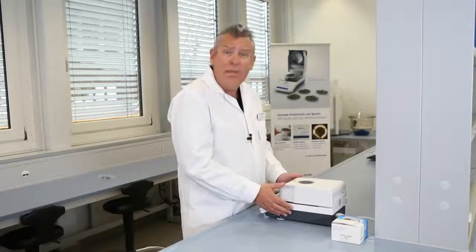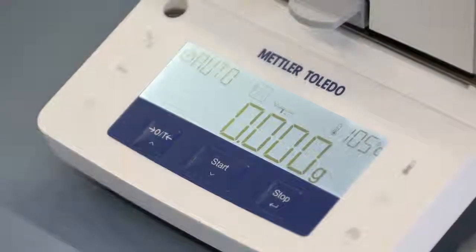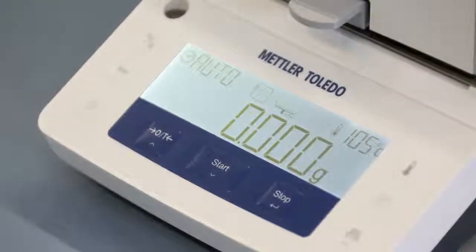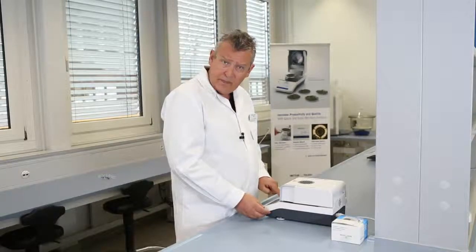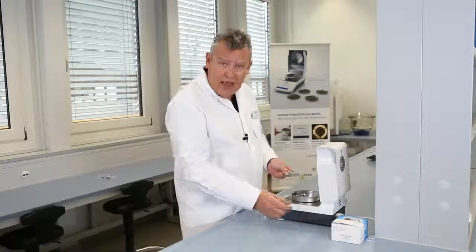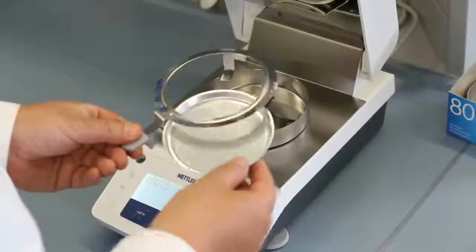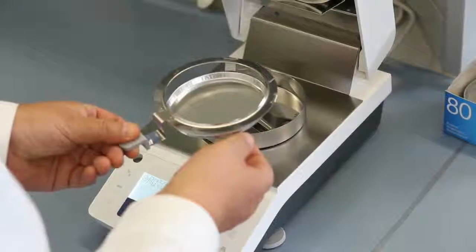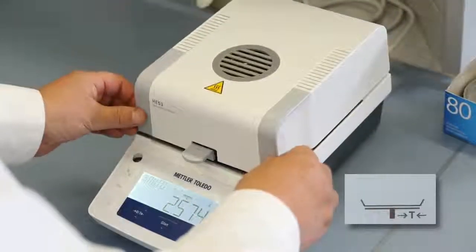Let's perform a measurement of potato crisps. Take a look at the icons on the display which guide you through the drying process. First of all, we need to place the aluminium sample pan in the pan handler, place the pan on the weighing pan, and then close the lid. Now we need to tear the empty pan.